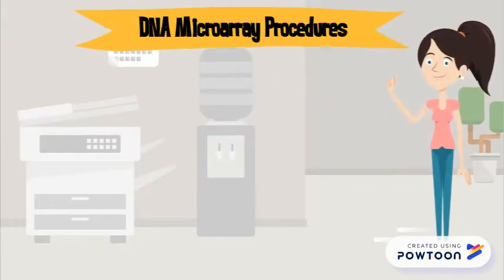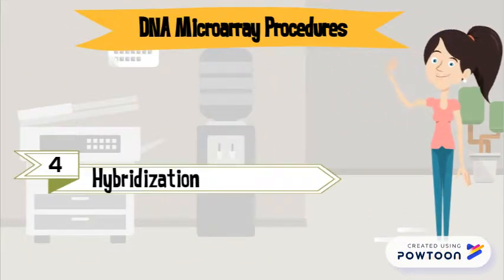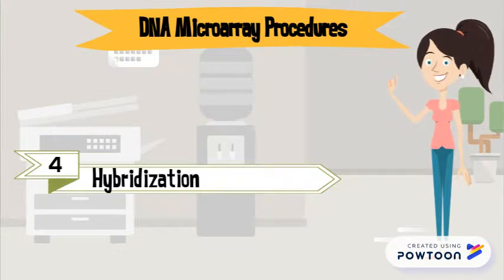Step 4 is hybridization. The cDNA created is applied to the microarray plate. When comparing two samples, apply both samples to the same plate. The single-stranded DNA will bind to the cDNA present on the plate.